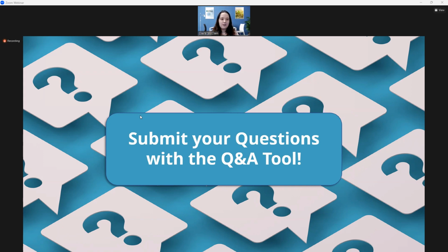Thanks, Kieran. Are Sterifix filters compatible with the environmental kit, and what other filters are compatible? Sterifix filters are compatible with the MagBind environmental kit. And in fact, we have actually developed a method to lyse the sample without having to remove the filter from the cartridge. And that can reduce the amount of manual handling as well. So there's no need to break open and manually remove the filter. Other than the Sterifix filters, the kit is also compatible with polyether sulfone filters.